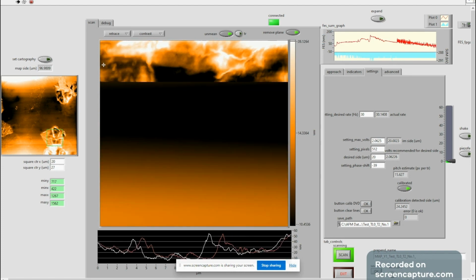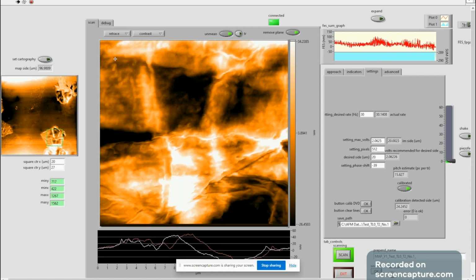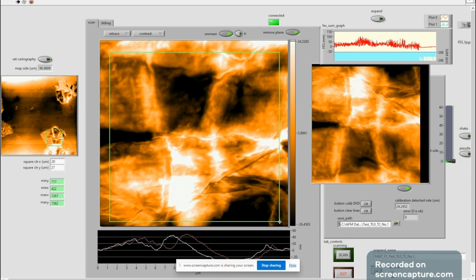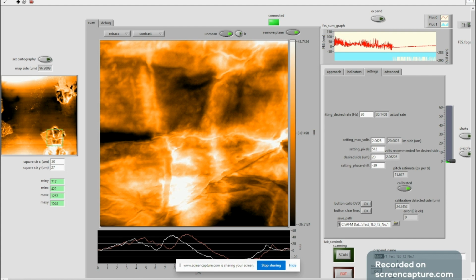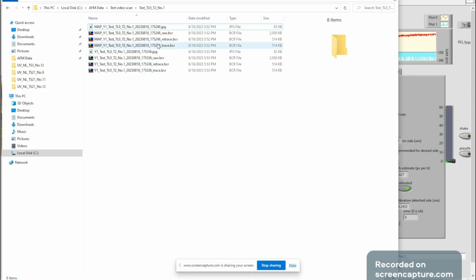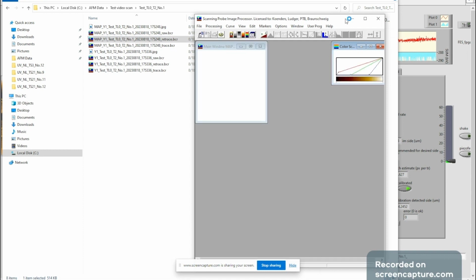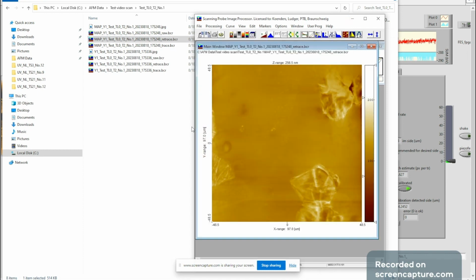And you see there is no tape in between in this image. So we save it as image 1, called Y1. In here we see how it's saved. We then open retrace. It gives a way better image when we open it in a scanning probe image processor.